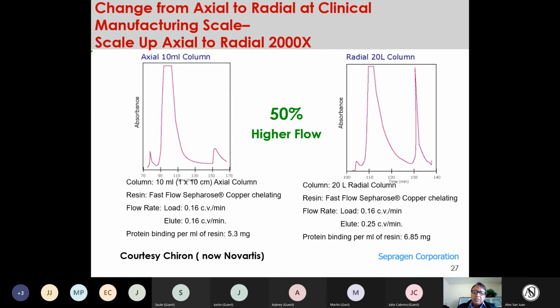And this was in phase 2 clinicals. So the production manager asked us for our help in reducing the time of that particular process step to under 1 shift. We said that was possible, but the question was, could they make the change when they were in phase 2 clinicals?